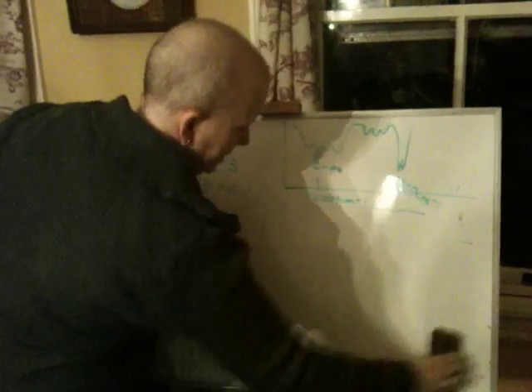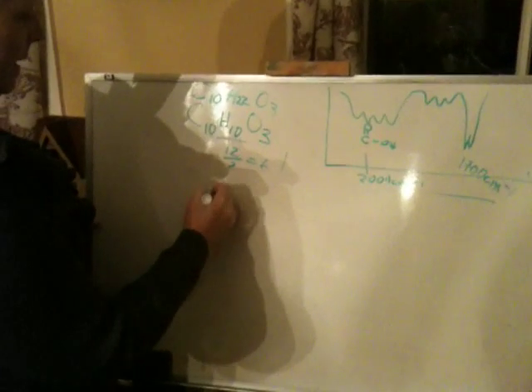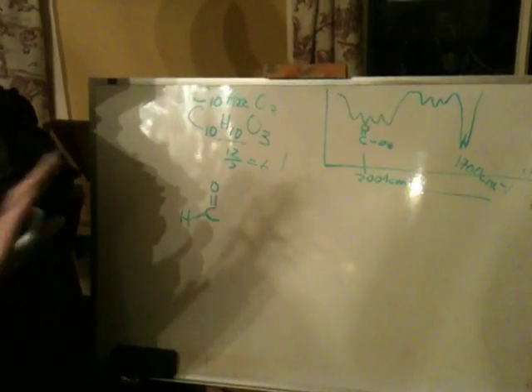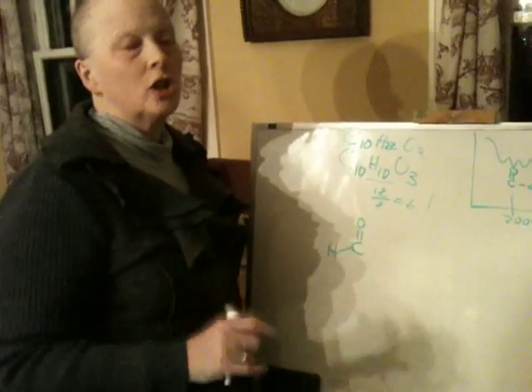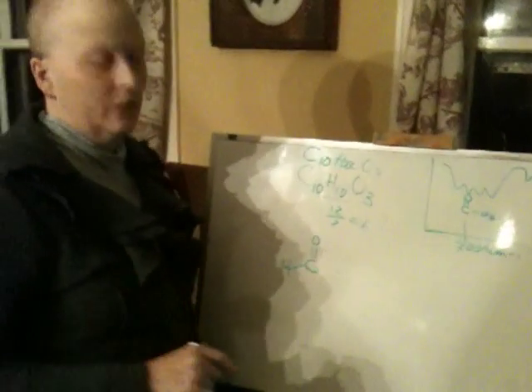All right, so let's put our pieces down. How many minutes is it now? Just 9. Okay, good. So let's kind of put this thing together. This is what we've got. We've got this aldehyde. And aldehyde is, and I base that totally on the position. You should start looking at the NMR IR tables that are in your binder, okay? This has 1 connection on it, okay? We have a carboxylic acid.